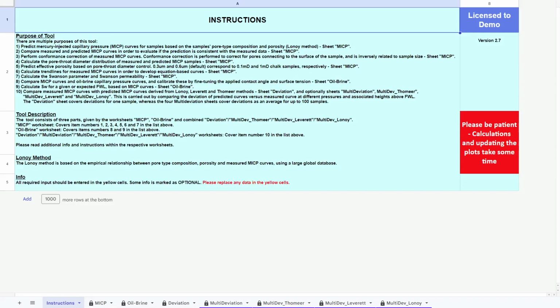This is the second in a series of 5 videos illustrating the MICP user data tool available in CARP. Please view all parts to get a full demonstration of the tool's use and capabilities. In this video we will illustrate the MICP worksheet of the tool.